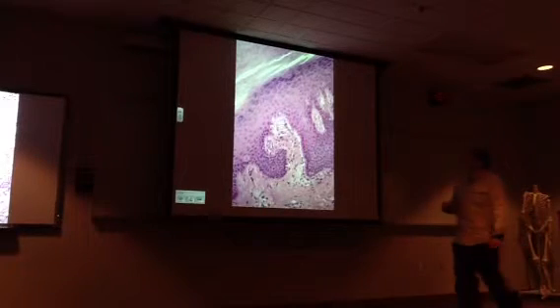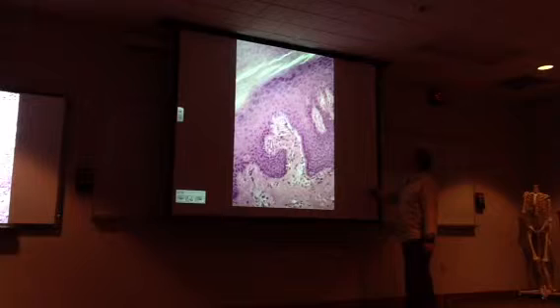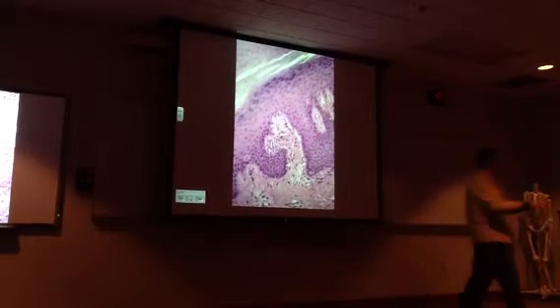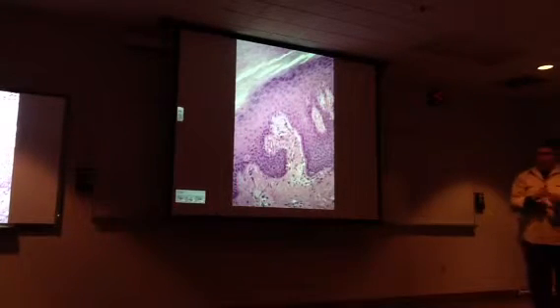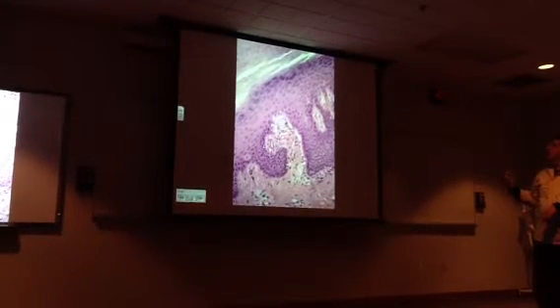These are some of the touch receptors near the surface of the skin. This is all a stratified squamous epithelium. Little layer of keratin above it. This is the dermis. These are dermal papillae, where these receptors reside.